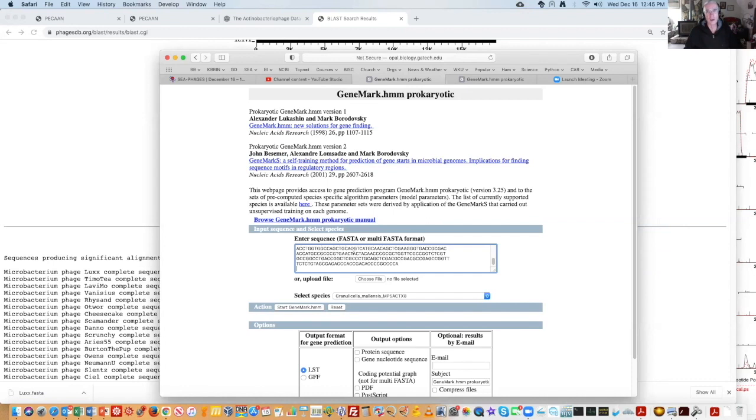Don't open and copy and paste from something like Word. That inserts all sorts of strange characters in there. I actually use BBEdit, which is one of them. Even TextEdit on the Mac sometimes will insert extra things. So use something that only takes the text and doesn't put in any control codes.